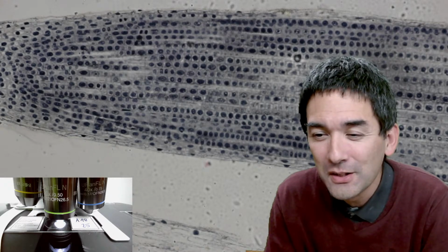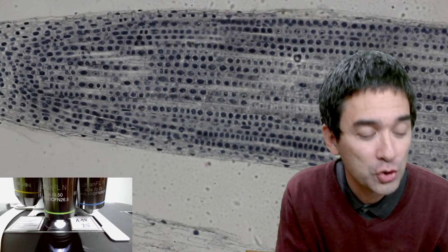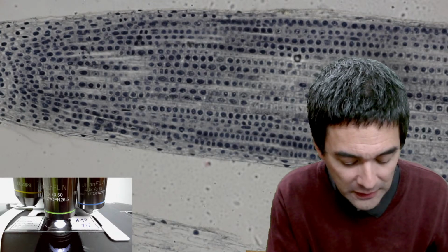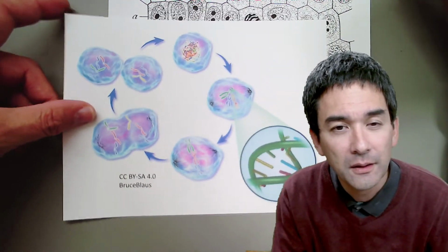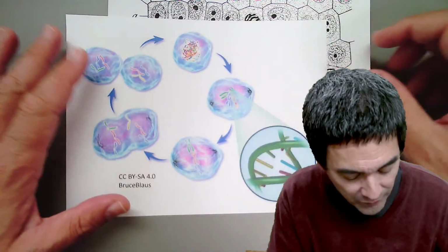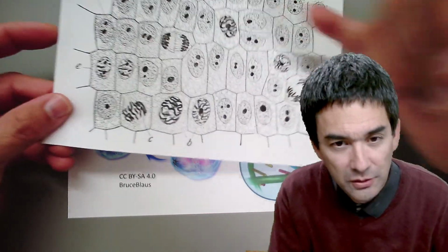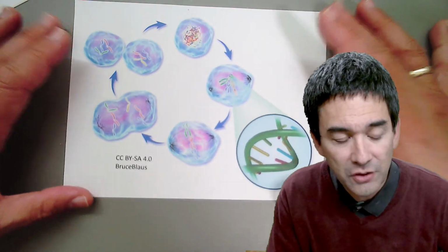So what I'm going to do now is play teacher, and I'm going to show you here a couple of pictures that I've found online, because understanding this is a little bit important, so that we also understand the thing that we see through the microscope. I got both of them from Wikipedia. These are onion cell drawings, and this is basically how cell division happens.